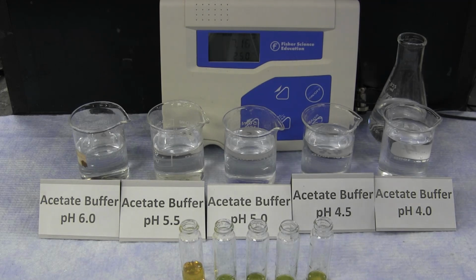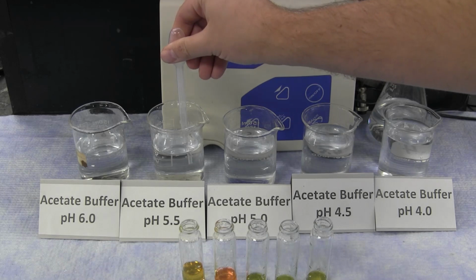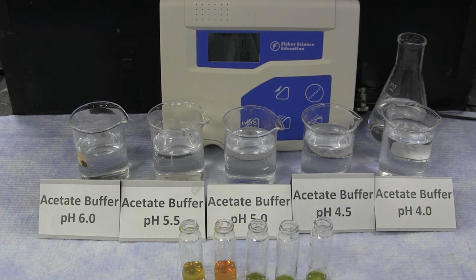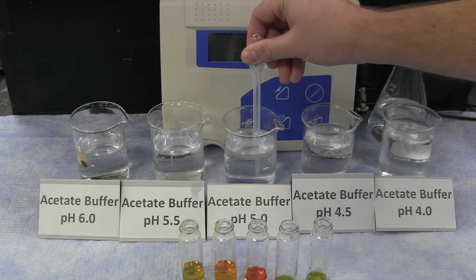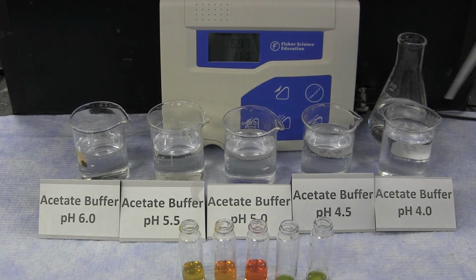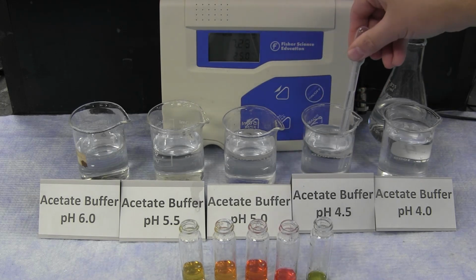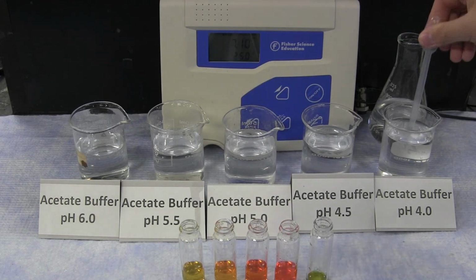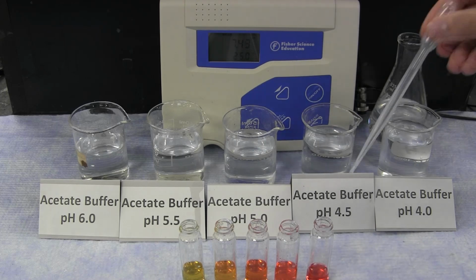At a pH of 6, it's more of a golden color. At a pH of 5.5, it's starting to become more orange. At a pH of 5, it's beginning to be even more orange and almost a red color. At a pH of 4.5, it's moving even farther into the red range. And at a pH of 4 is a darker red solution.